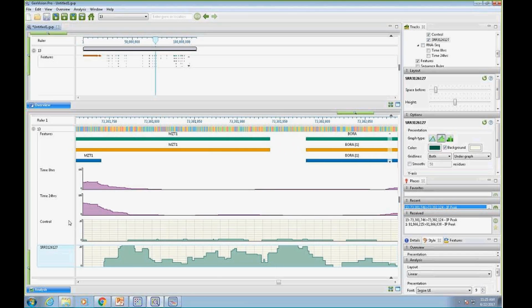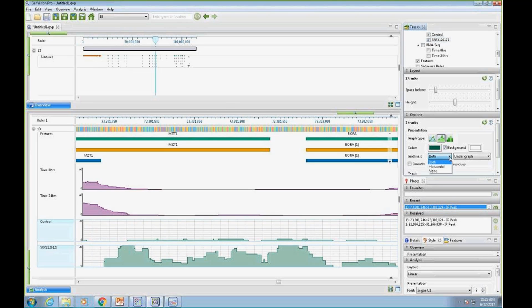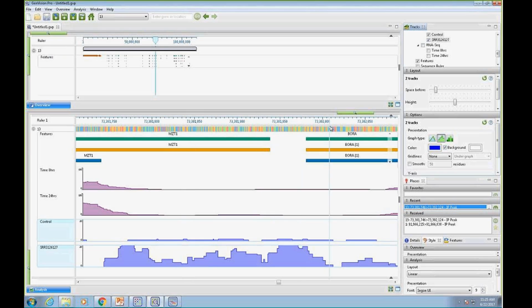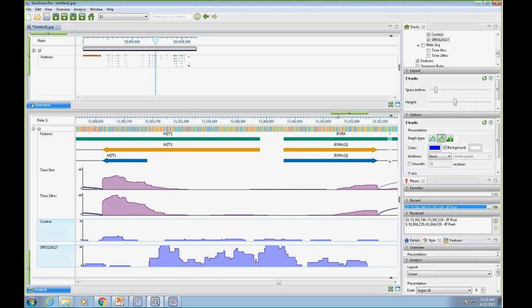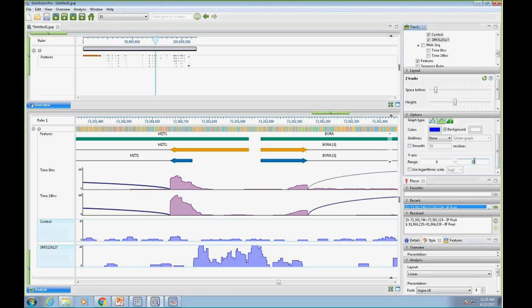The first thing that pops out is, oh, I don't really like the way that graph looks. So I can highlight an area and change the style so it's a little easier for me. I don't want the grid lines in there. Maybe I don't even like the color that much. So I can change what this looks like. I can change the magnification scale as well. You can see that we're zoomed in quite a bit. And as I zoom out, I can see even my range needs to be adjusted a little bit. So I can keep making adjustments and say, well, I want a little bit more of a Y scale.